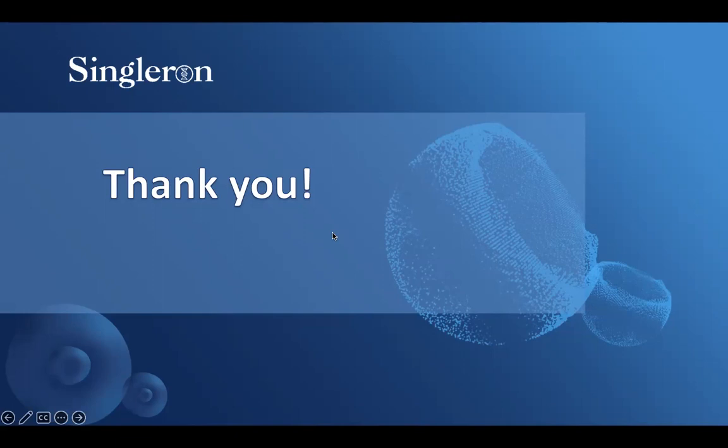Because, for example, I am also a neuroscientist working in brain, and for the microglia, we have several markers, which could be expressed only by microglia, but also in the macrophages. So we should be very careful. Therefore, to be on the safe side, how many barcodes do you use? And the last question is for the spatial transcriptomics. You said that you are lysing the slice, the tissue on the slide. If we are talking about the brain cell, how thick should it be? So these are the questions that I would like to ask.